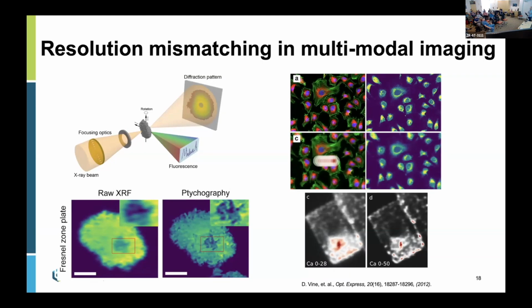The difference is we need to add a continuous sample motion in this signal modeling process. By adding this continuous sample motion, we take a high resolution image, we can simulate the associated low resolution image, and we can simulate thousands of those image pairs.